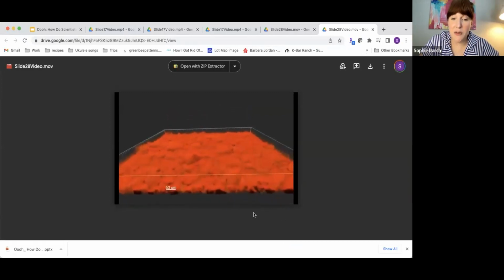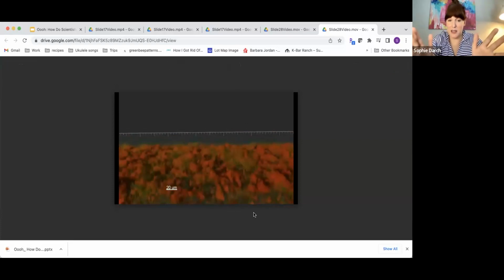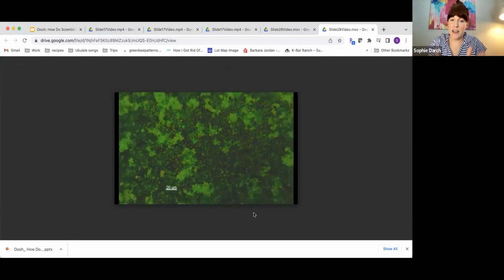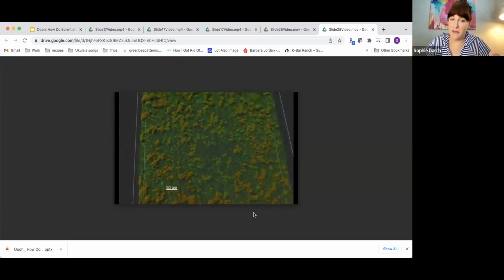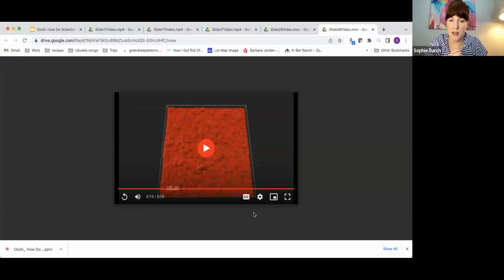Also I should say, in this video you're seeing a lot of time squeezed into one small video. The bacteria that we're actually looking at will divide every 30 to 45 minutes. So this is actually a lot of time condensed into one short video. We'll probably take images maybe every 25 to 40 minutes so we can capture those divisions. But that's a nice thing, that you can speed it up to show people how this visually happens. But of course, this happens over a slightly longer period of time. That's important to remember.